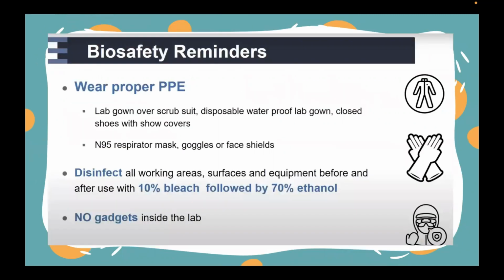So a few reminders for your biosafety reminders, even sa different section of the laboratory po tayo mag-work, this is also applicable. Number 1, please wear your proper PPE, your personal protective equipment. We have the manner of sequence. If donning yung gagawin natin, yung proper sequence naman, if doffing, alam kong kabisado nyo na yon.